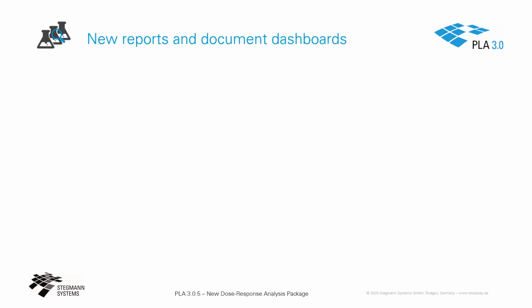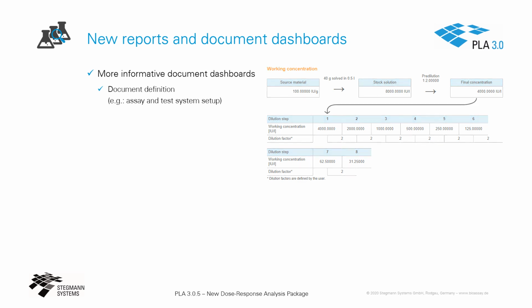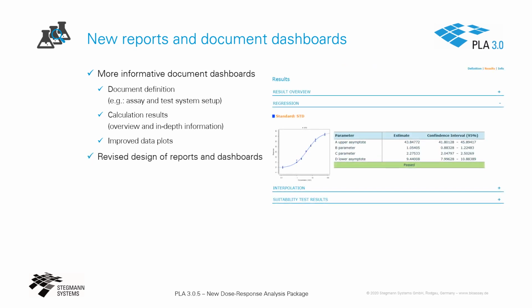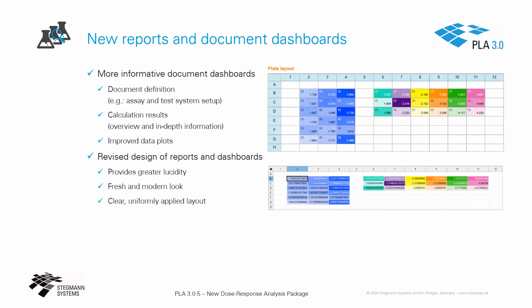New reports and document dashboards further add to the package's value and usability. The dashboards display key attributes of document definitions and calculation results, and visualize results in improved data plots. The revised design of both reports and dashboards provides greater lucidity with a fresh and modern look, clear, uniformly applied layout, and a uniform color scheme in line with editors.